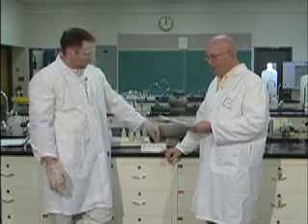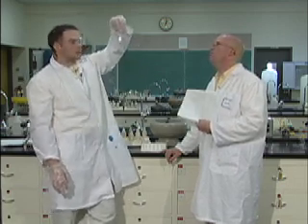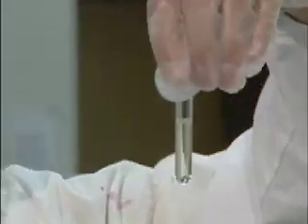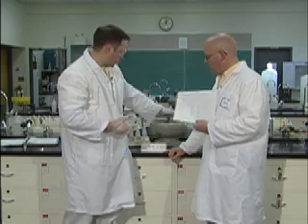Gotcha. Now, while we're waiting for that to happen, you can see here in this solution, we still have lots of solid there. So this is what we decanted off. If you find that you're getting solid back into solution, you can centrifuge this again and then decant it again, just to double check. All right. Okay, that makes sense.